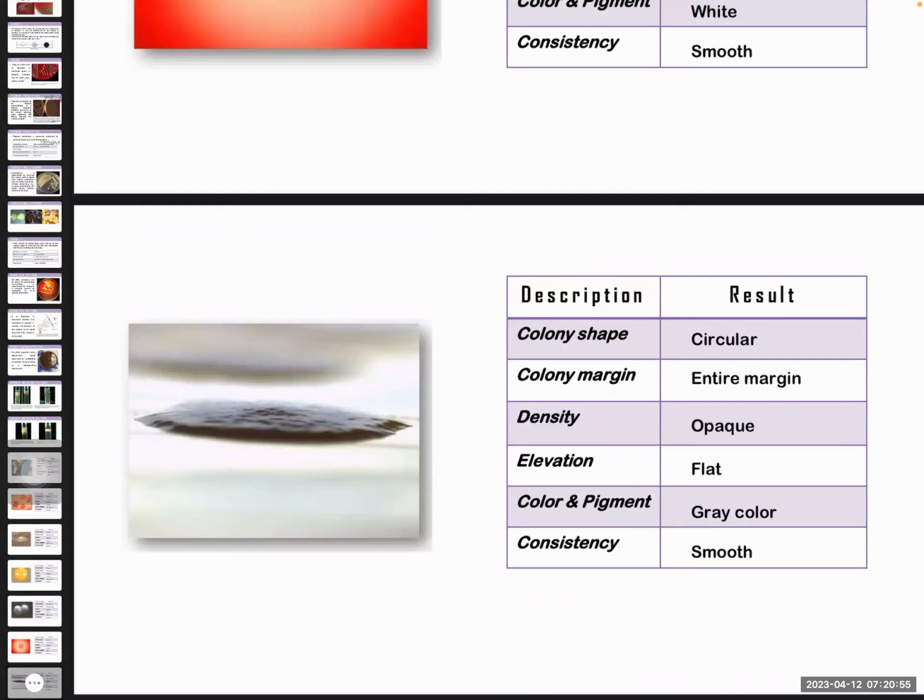In real life, this is what our textbook says, class. But in real life setting, since I've already told you earlier, from previous discussion, karamihan kasi ng laboratory, they already use automation or machines to identify the organism. So, what they usually describe, commonly na lang na sinasabi is size, color. Yun, size and color na lang yung ginagamit nila.